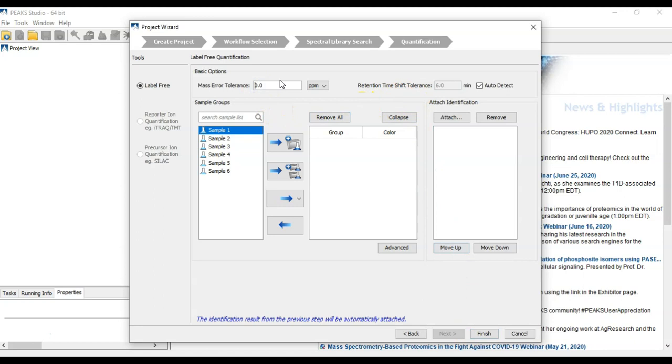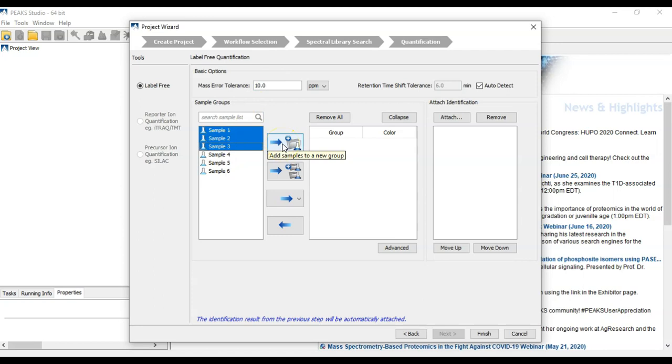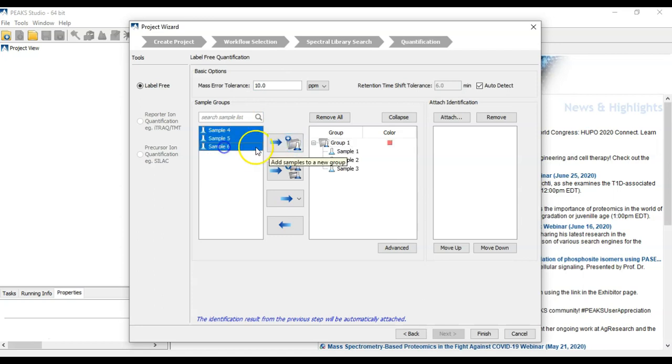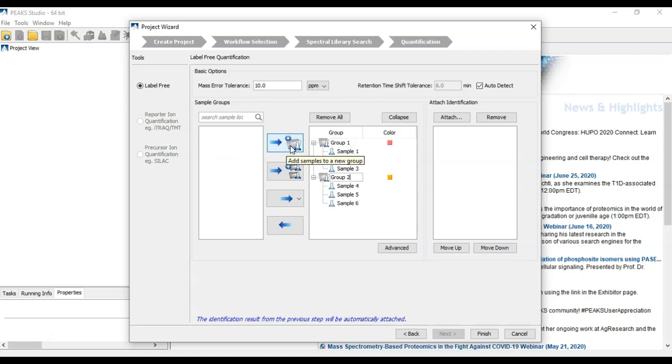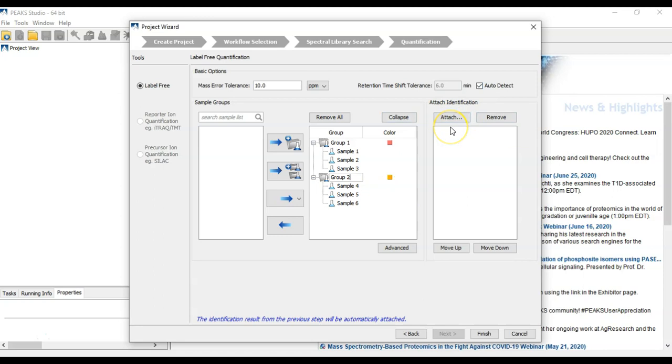We set our error tolerance. Select samples 1, 2, and 3 from condition 1. 4, 5, and 6 are from condition 2. One of the things that's new in PeaksX Plus is we have the ability to auto-detect the retention time range by looking at the difference between the retention time of the features during the search. It will automatically attach our library results. Click Finish, and it will start the search.